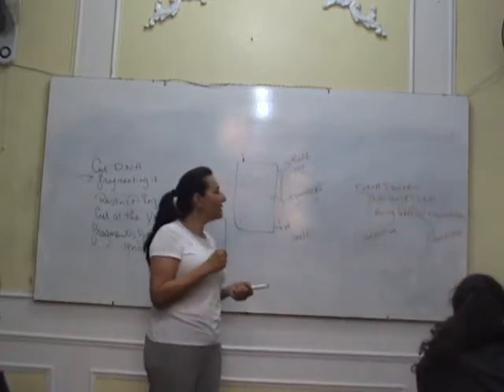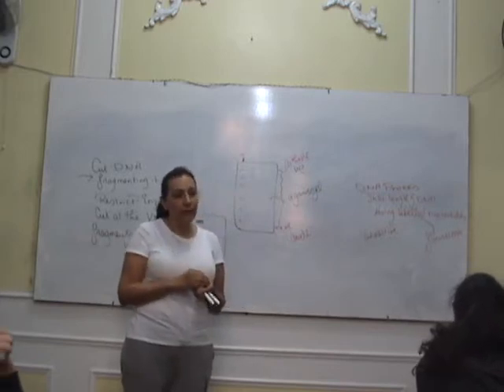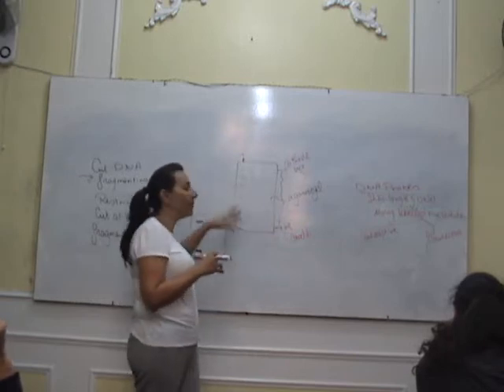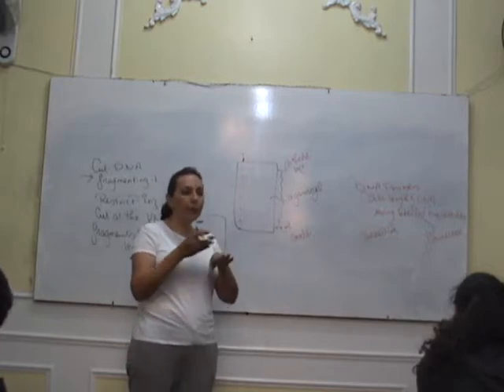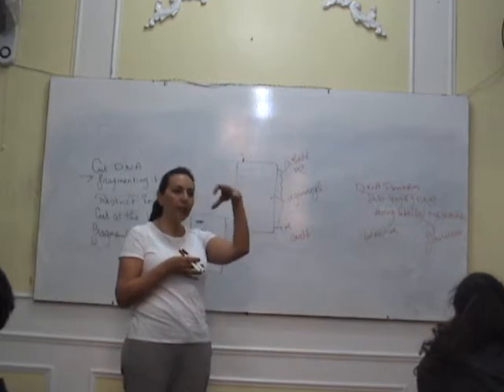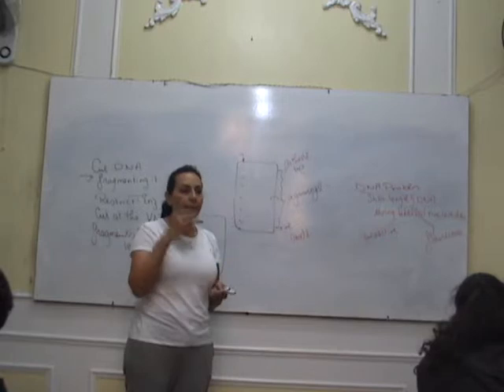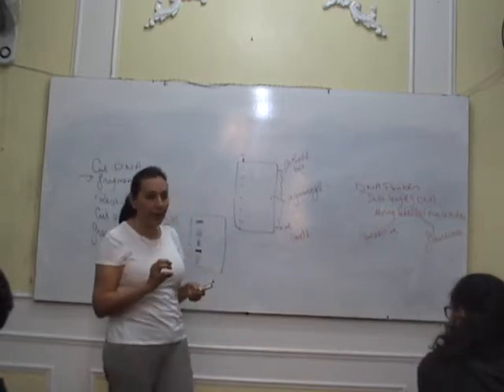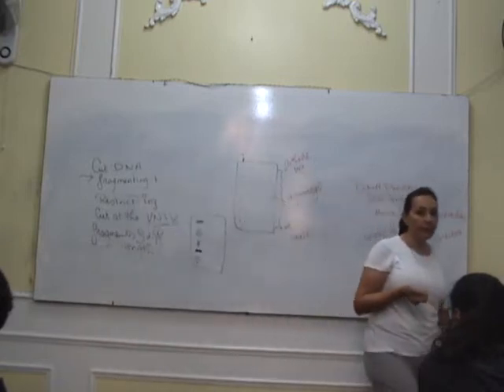Fluorescence is not the same. In fluorescence, the DNA probes will glow in ultraviolet light. So when I add the DNA probes to the DNA fragments that I have on the gel electrophoresis, the probes will move and bind with the complementary bases. Then you put the ultraviolet light and the bands will start to glow. It's a length of DNA, synthetically made, using labeled nucleotides, and it is made to be complementary to the VNTRs.